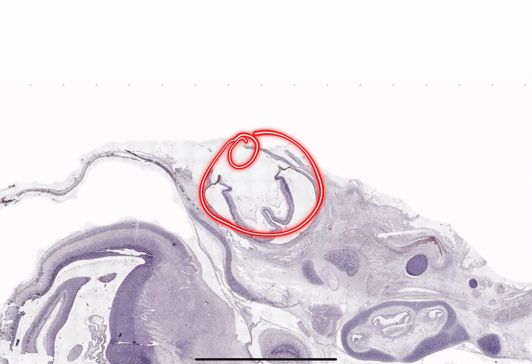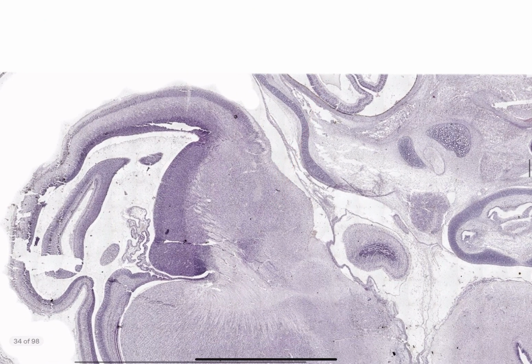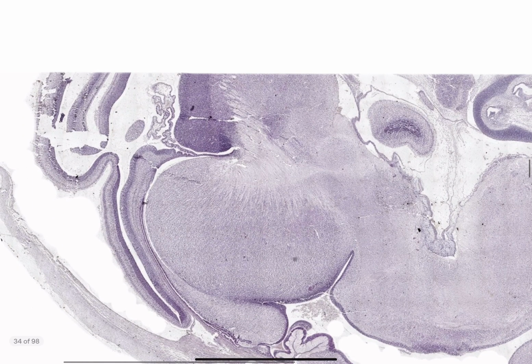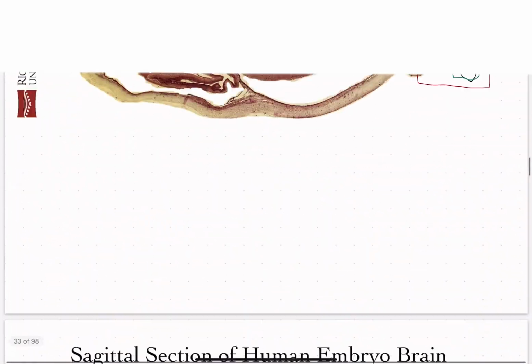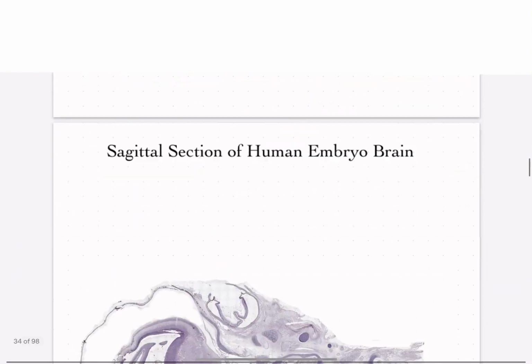Now, if we do this, and we imagine, there we go. There's a lens here, and this is the general eye area. Now, if we go towards the bottom left-ish area, we can see the nucleus caudatus more prominently here with the migrating neuroblasts. We can see the thalamus as well very prominently, but the best way I can describe it is that the nucleus caudatus has a clear, dark edge or corner compared to the thalamus that's very light in comparison.